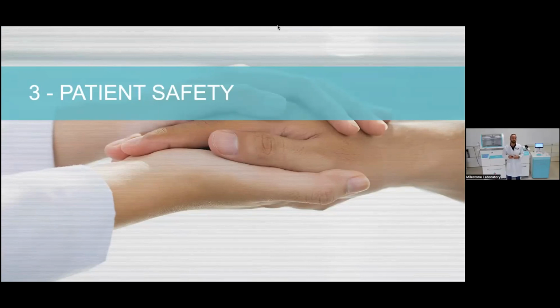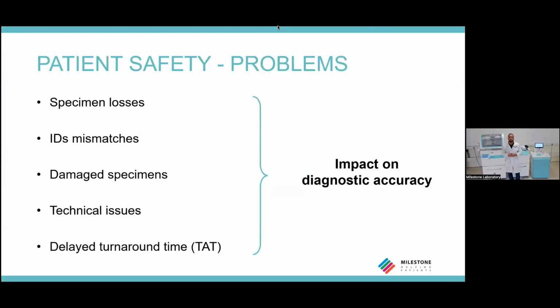But first, which are the problems that can affect patient safety? Several issues can occur from the patient's point of view. As I told you before, specimen losses, ID mismatch, for example, there could be a cassette switch during grossing, or damaged specimen.